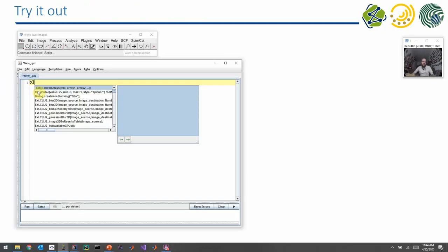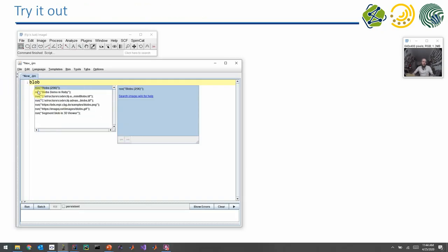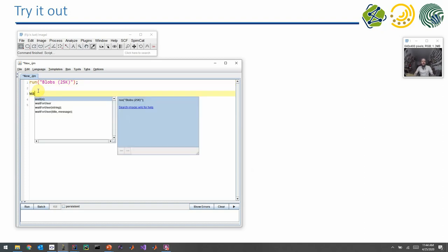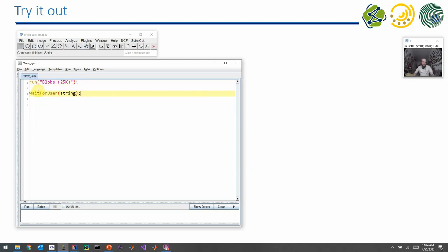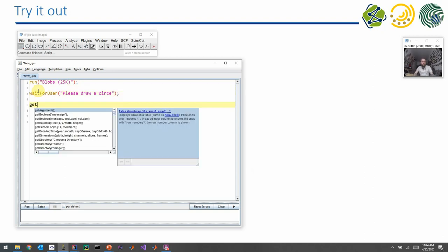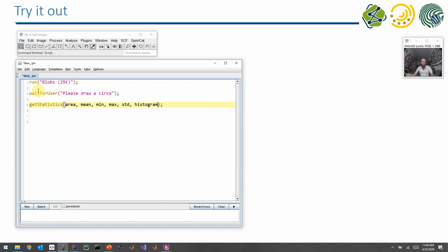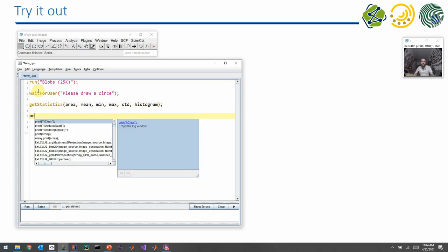Let's just try that out. I open an image, just the blobs image as an example. Then I tell the user, please draw a circle, and then I print out the area of the circle.